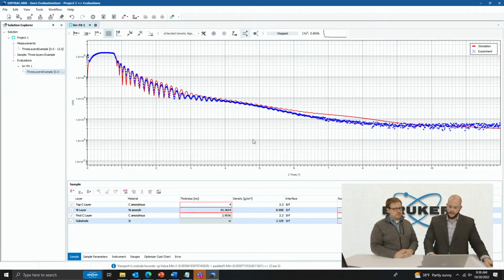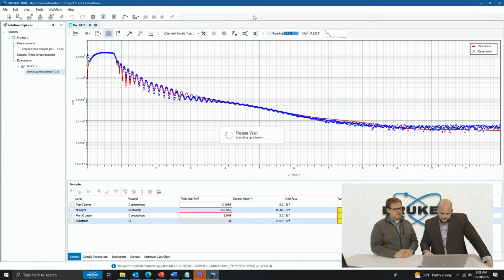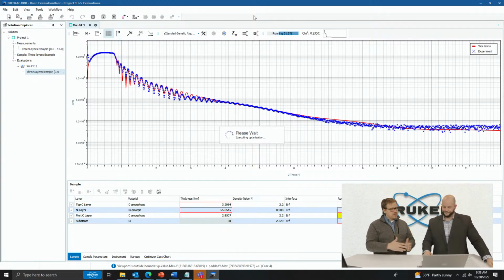Okay. So let's go ahead. I'm going to stick with genetic. Let's see what we get. And I do see, though, that it is in a better state, and it's approaching a better state, although we still are hitting a few limits. Yep. Not nearly as many as what we did before. So we're getting closer to the answer, I think.